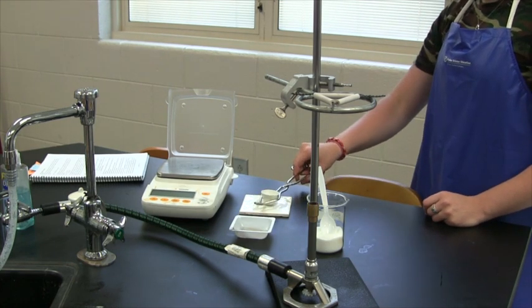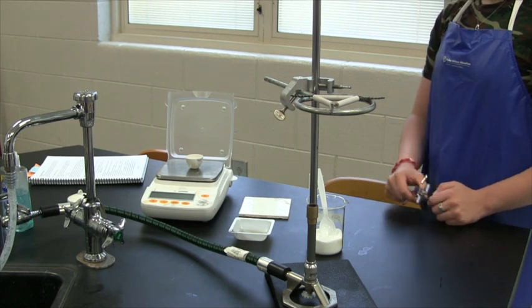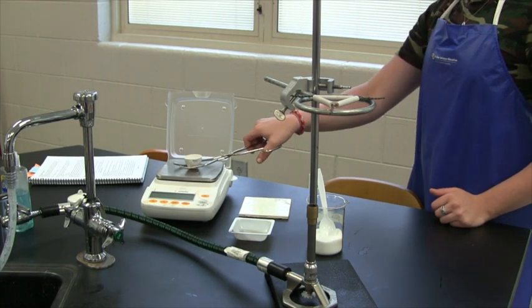Next, you use the crucible tongs and place the crucible back on the balance. Now you'll find the mass of the crucible and the hydrates together.